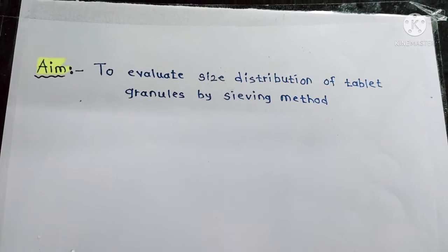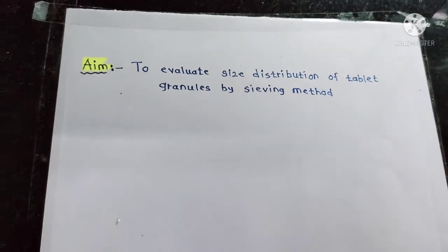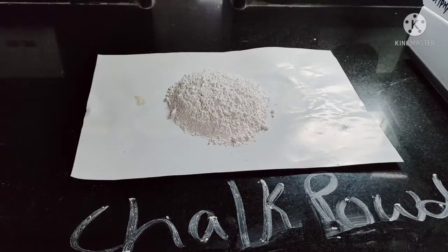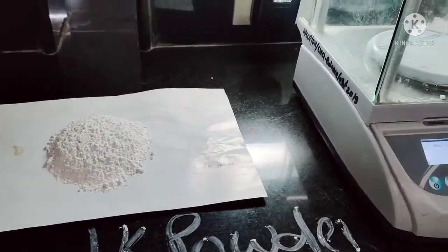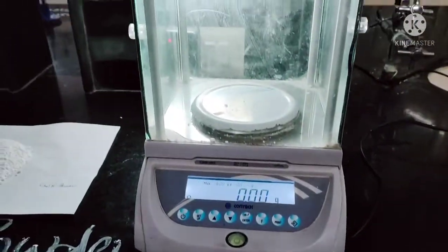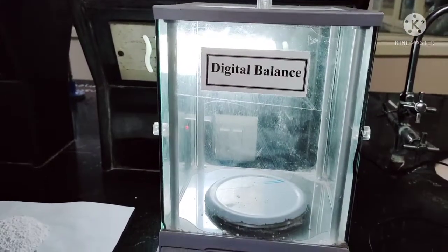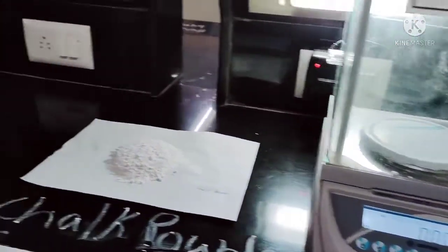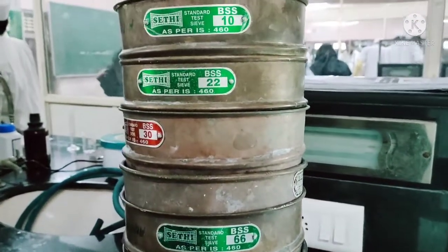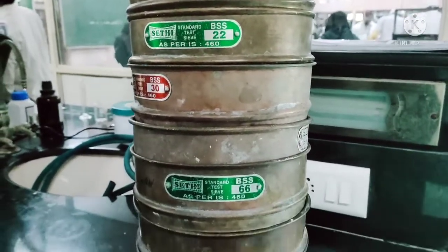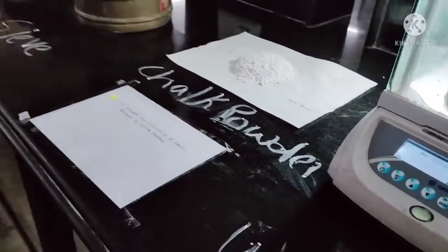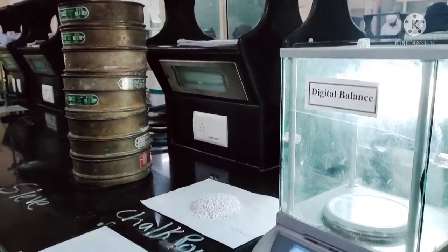The next practical is to evaluate the distribution of tablet granules by sieving method. For this practical we require chalk powder, digital balance, different number of sieves, and sieve shaker machine. We also require butter paper and spatula.